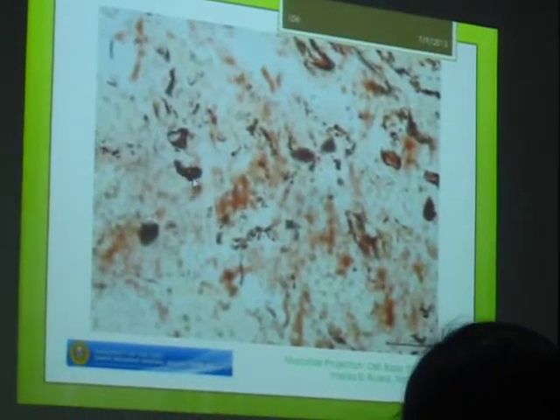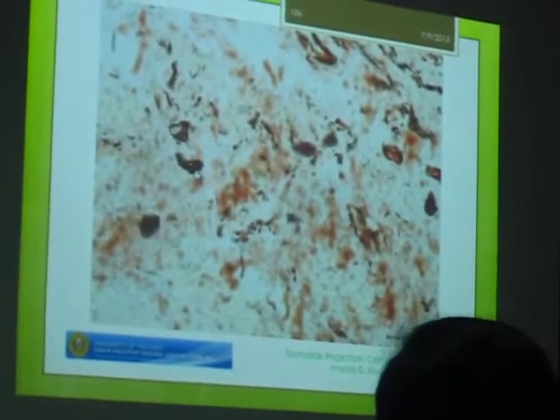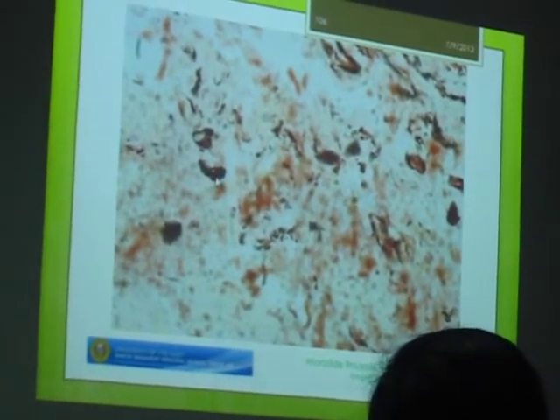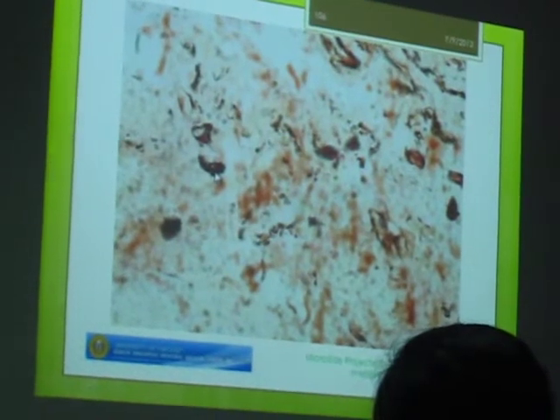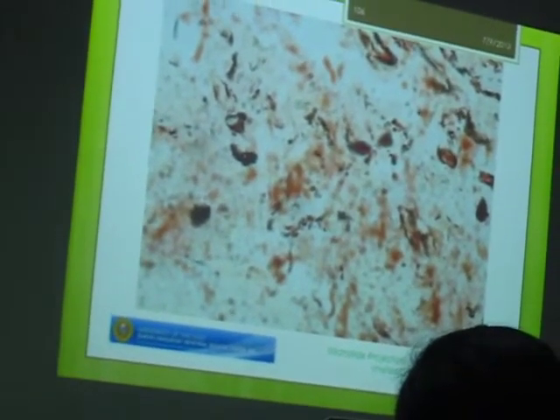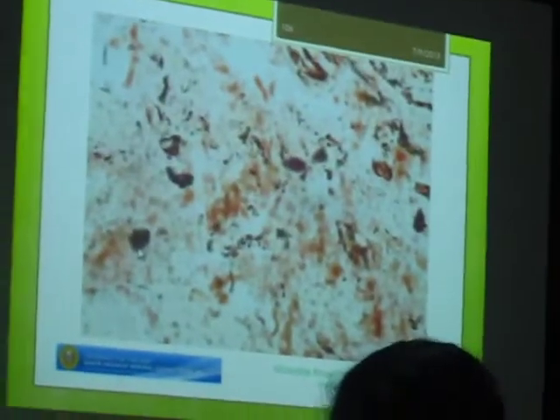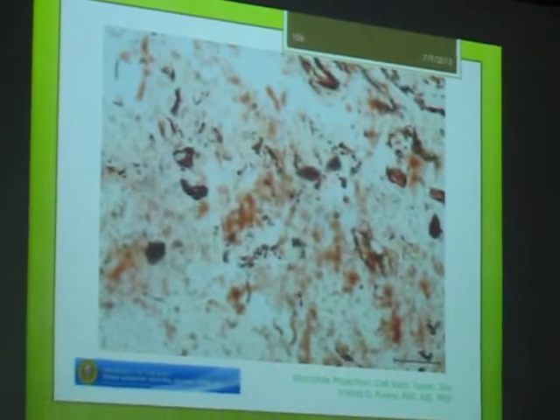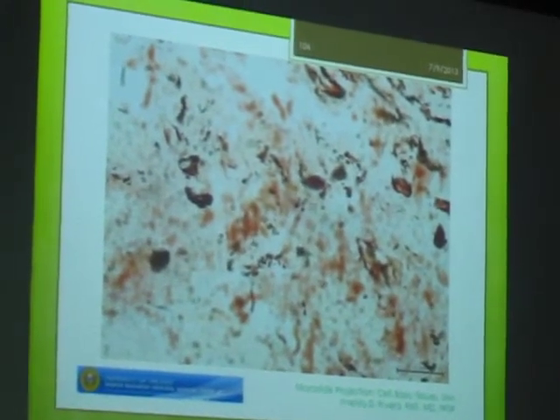Identify the pointed cell. Mast cell. Mast cell is a connective tissue cell, one of the connective tissue cells. It contains abundant granules. That's why you see only dark structures inside the cytoplasm, and these granules obscure the nucleus.